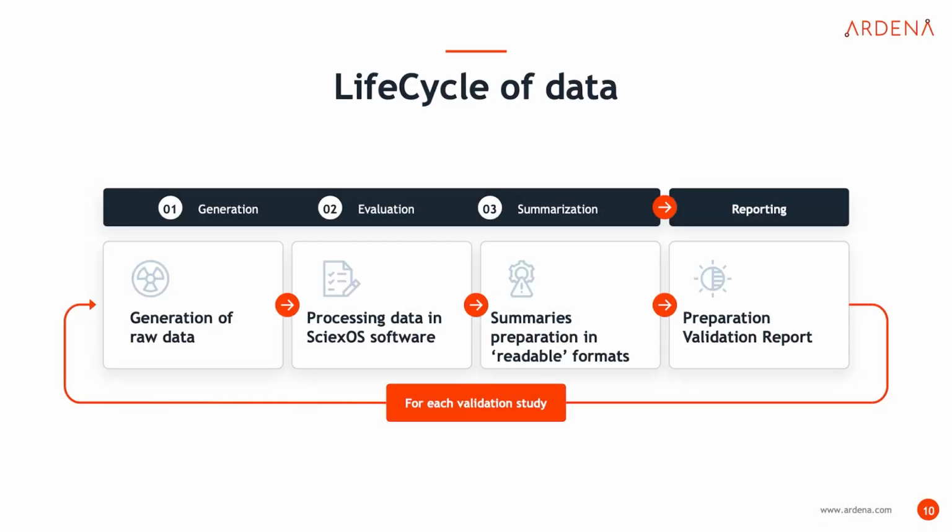Life cycle of the data. Data integrity is not a one-time event, it's a life cycle. It begins with raw data generation on a SCIEX OS system, for instance, continues through the process and evaluation, and ends with the reporting. Each step in a CRO lab should be traceable, auditable, and also reproducible. SCIEX OS software supports this life cycle by providing tools for secure data handling, automatic calculation, and standardized reporting. In the next slide, we will talk about how we are approaching this life cycle of data in our Ardena bioanalytical lab.